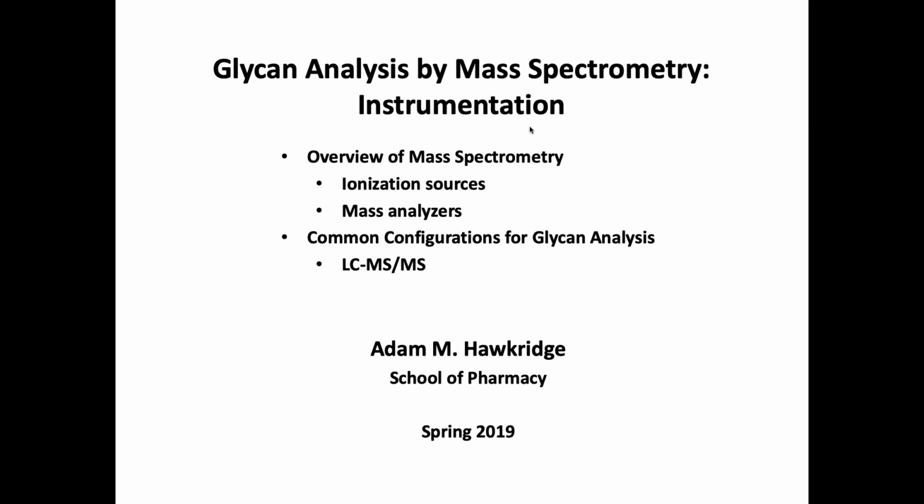So how many folks are familiar with mass spectrometry? Just to get an idea, have you ever taken anything that I've taught before, like medchem? Yeah. So you will probably see some of the same slides because of the overlap, but for the most part, the first set will focus on the technology. So again, the first part, an overview of mass spec, will focus on ionization sources and some of the key mass analyzers, and then some of the common configurations for LCMS.